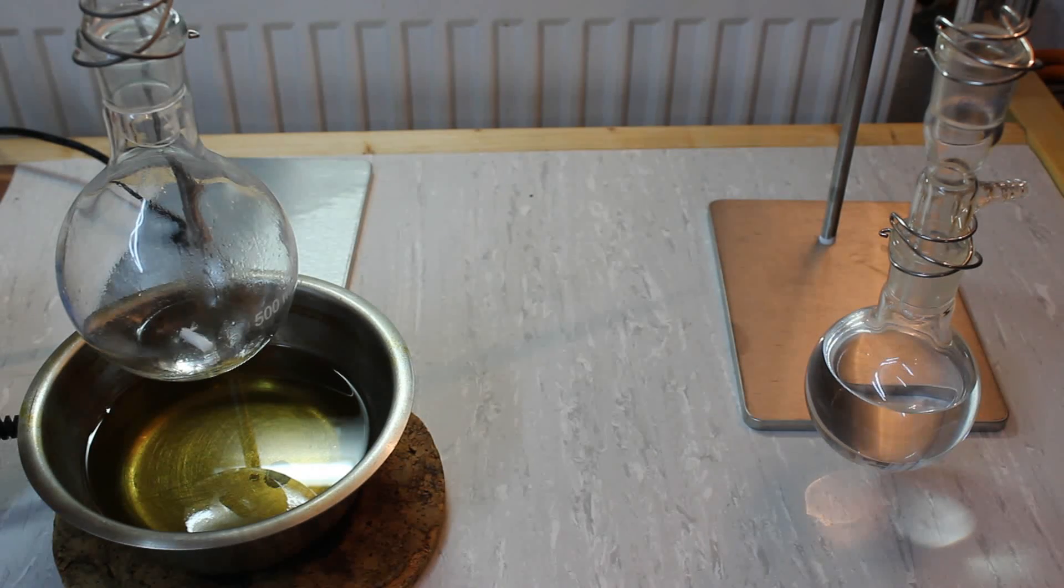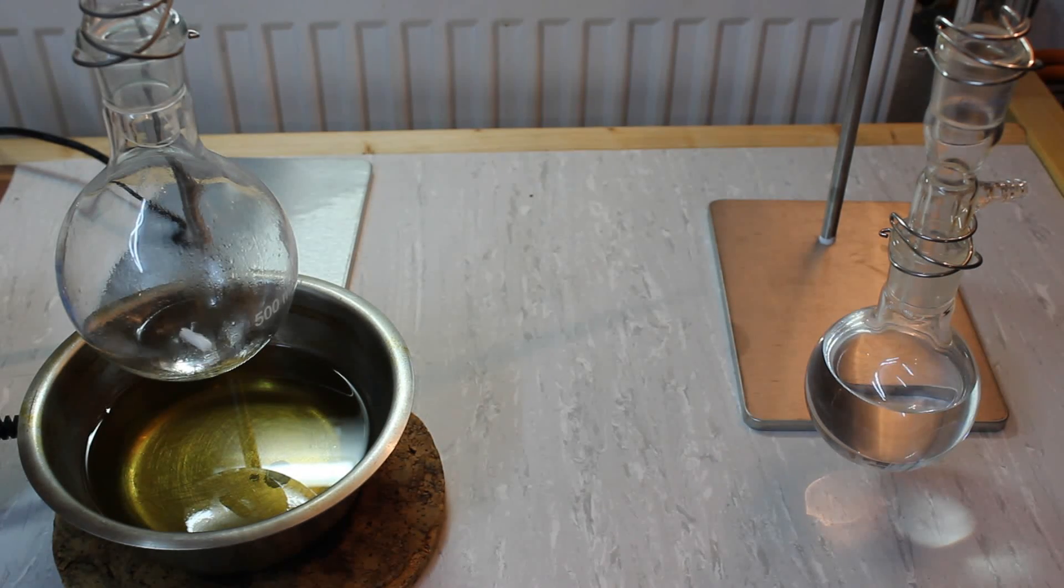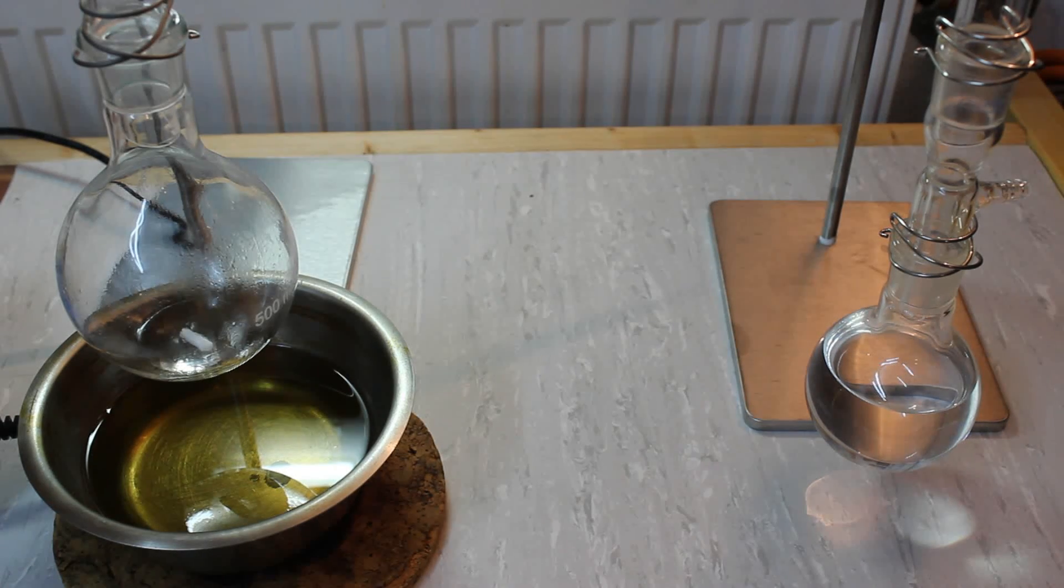I've stopped the distillation and in the boiling flask we're left with a little residue. The still head temperature constantly remained at around 55 to 56 degrees Celsius, so this indicates our acetone was pretty pure to begin with.